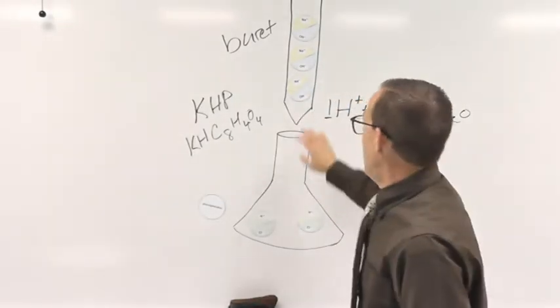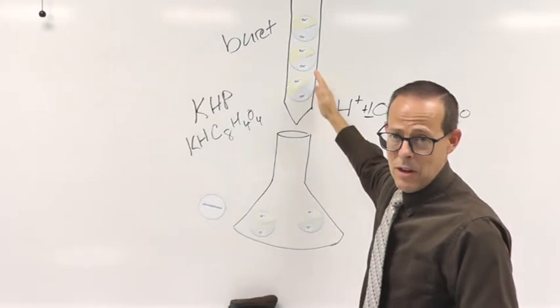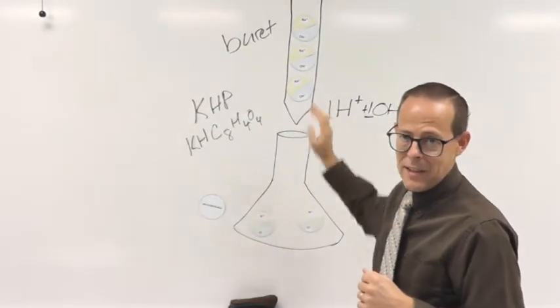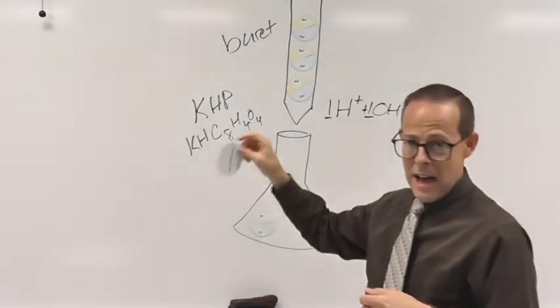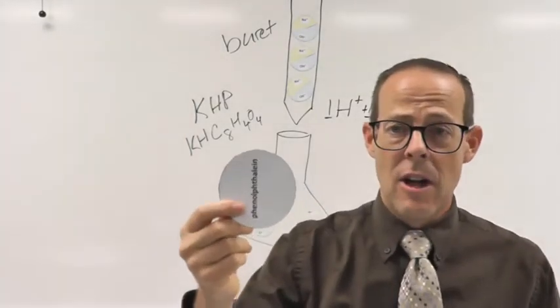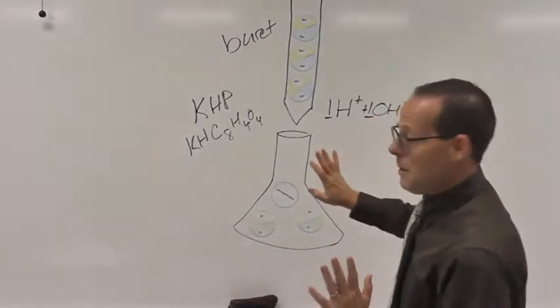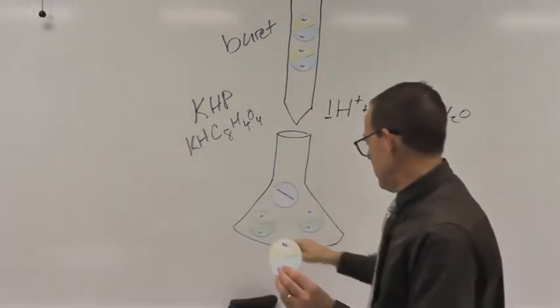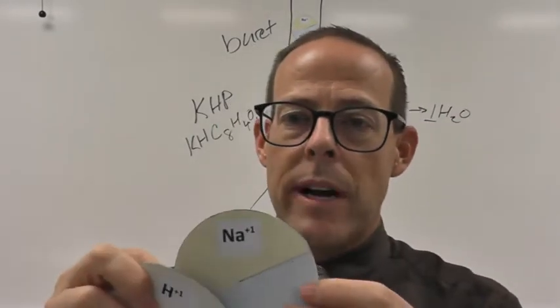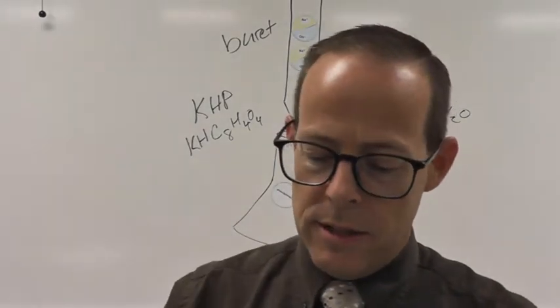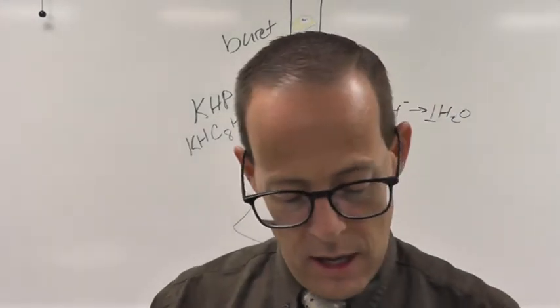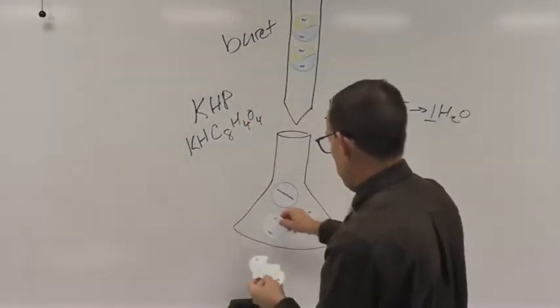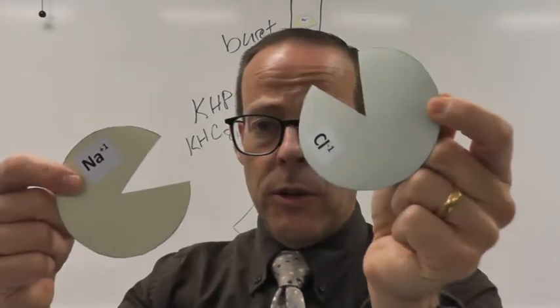So here's basically how a titration works. In our burette, we have some sodium hydroxide. It doesn't have to be sodium hydroxide. We could have the hydroxide down here, but most titrations are like this because we're caring about the acid, not the base. So the first step is we have to add phenolphthalein, an acid-base indicator. We've got to put some of it down here. I'm going to drop some sodium hydroxide from my burette into my flask. And essentially what's going to happen here is this is going to break apart. It's actually already broken apart because it's soluble. And this is broken apart, and what's going to end up happening is my Hs are going to form some water. And so I've got some water down here, and I'm just going to have some Na's and Cl's floating around.